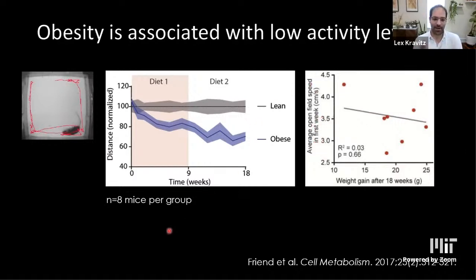So I think this is an okay approach for moving forward, but this took a lot of work to gain data from, in this case, just 8 mice. We've done larger groups, but they're pulled out of their cages every week, or sometimes we skipped a week, so every 2 weeks. We take out 16 mice, we put them on the floor, we videotape them, we process the videos. By the time you're done with all of this, you've spent almost all of your time collecting data on a group of 16 mice, and the density of the data is pretty low. We're ultimately recording, in this experiment, about 20 minutes per week of the animals, which calculates out to about 1% of their life that we actually managed to observe.